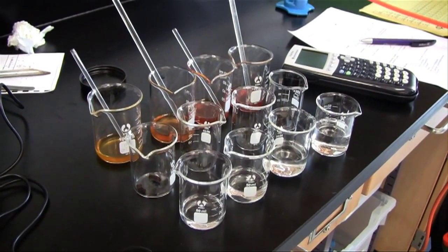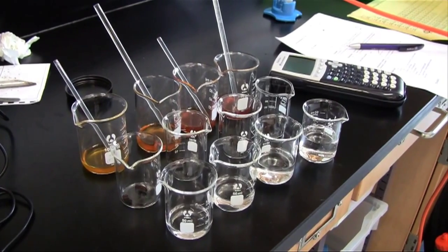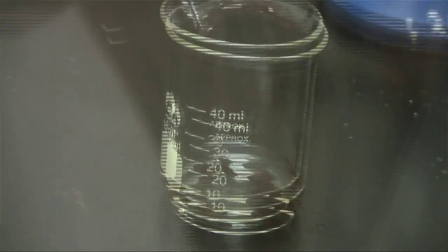The top row has iron 3 chloride, the second row has iron sulfide, the third row has hydrochloric acid.